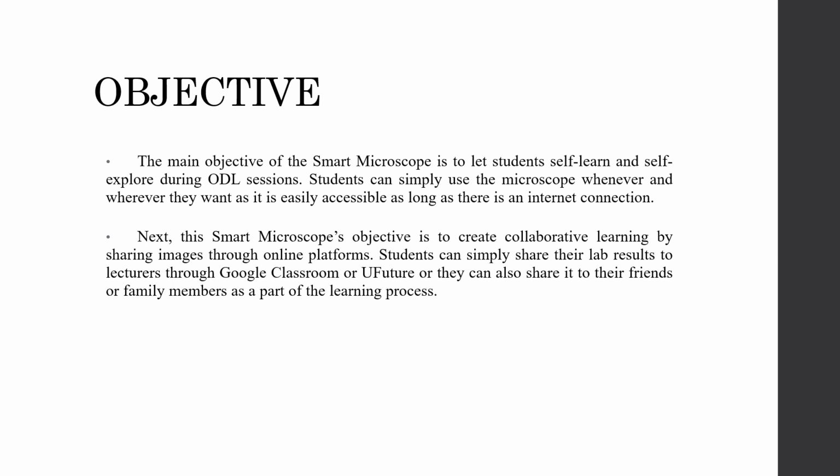Next, the objective of this project. The main objective of this microscope is to let students self-learn and self-explore during ODL sessions. Students can simply use the microscope whenever and wherever they want, as it is easily accessible as long as there is an internet connection.